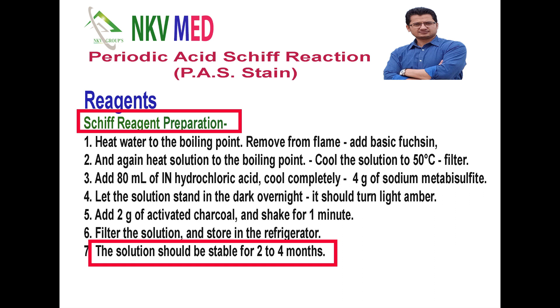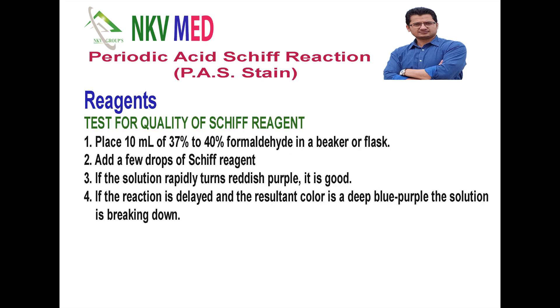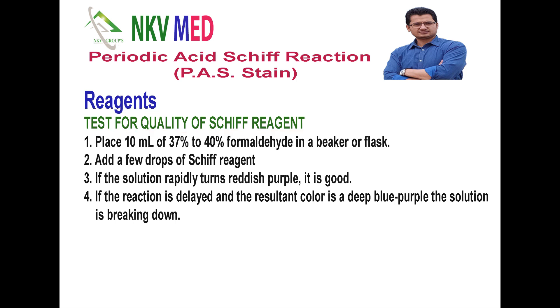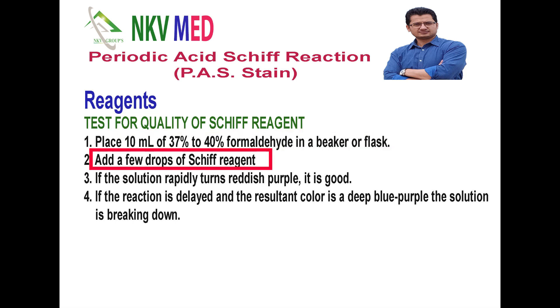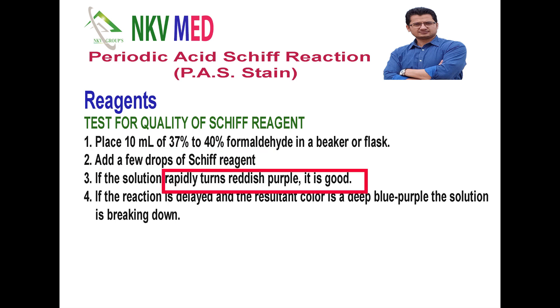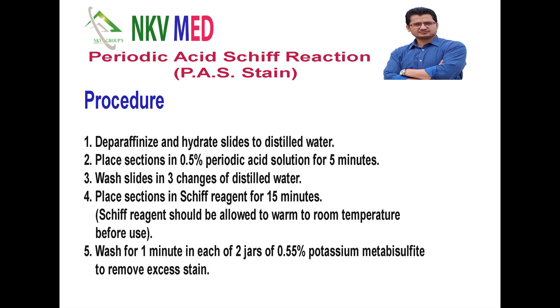To check whether the Schiff reagent is working properly: take 10 ml of 40% formaldehyde in a beaker or flask, then add a few drops of the prepared Schiff reagent. If the solution rapidly turns red or purple, that means you have prepared a good Schiff reagent. If it does not turn or is delayed, the solution has not been prepared well. Now all reagents are ready for PAS staining.